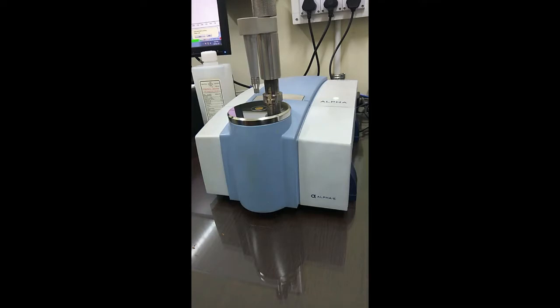At the same time, it is used to fill any kind of air bubble or any kind of gap that may occur during the sampling process. However, during the liquid sampling, we just place a tiny amount of sample and continue reading it in the software which is provided. Let's now move to the software and look at how this particular instrument is handled through the software.